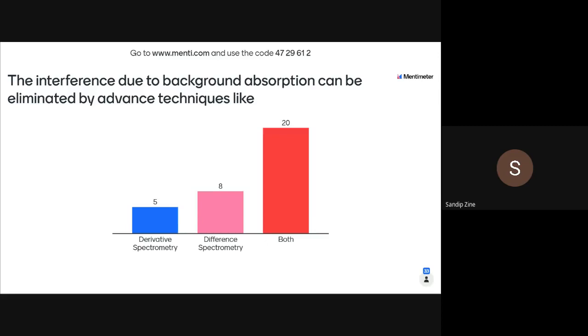And so it's difficult to judge which peak is of our analyte, whatever we are analyzing, or whether our analyte peak is interfering with impurity peak. Maybe that impurity is from solvent, or maybe any other impurity while adding or while taking sample for processing.